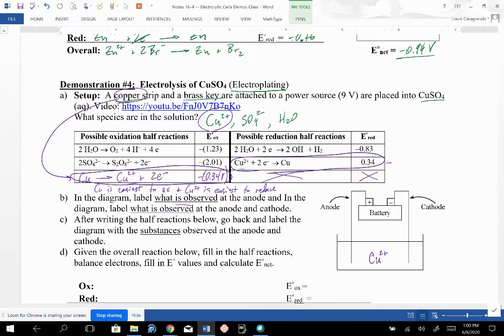So at the anode is the oxidation. If we were to measure it, you can't see it unless you run this a really long time, but the copper loses mass. It's losing mass as it's being oxidized from copper to copper 2+. The copper 2+ is coming off the electrode as it's produced, not the copper metal. And electrons are flowing out of the anode. Electrons are flowing into the cathode.